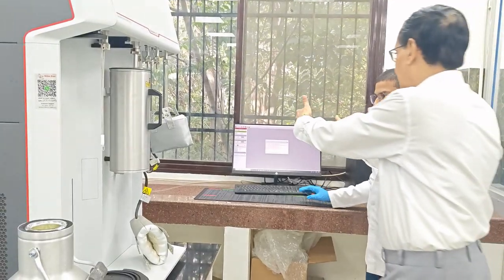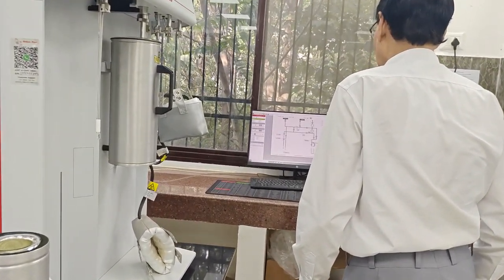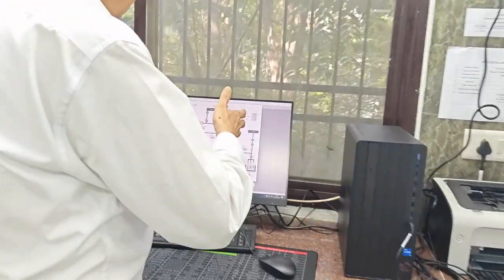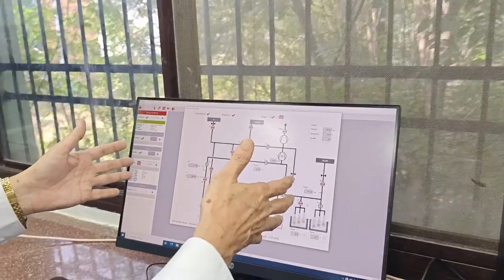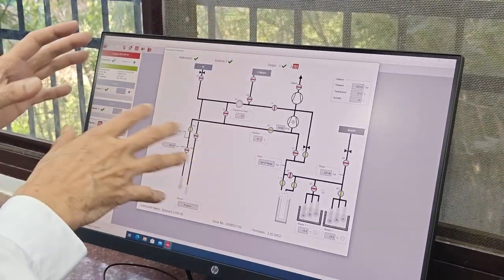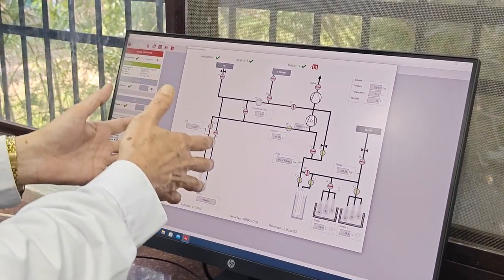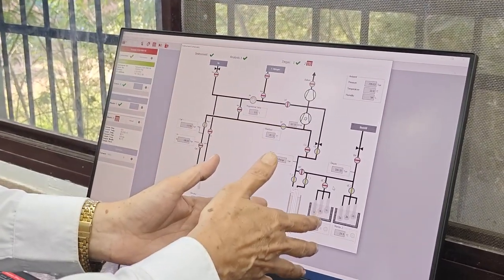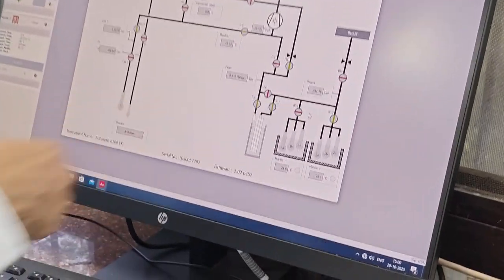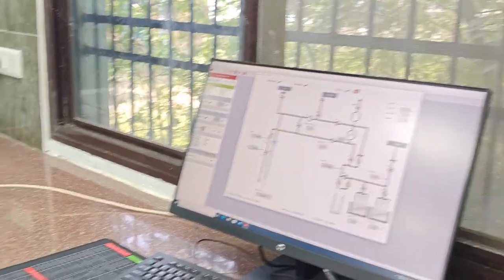The structure diagram that you showed, let us show it once, so that in my theory lecture I have also given this. I am also giving the detailed information about these things in my theory lecture, and if you see this, everything is clear, what I have already discussed, the analysis part, then the degassing part. You see everything is here, the types of degassing and everything is there. Okay, now we can start the sample analysis.